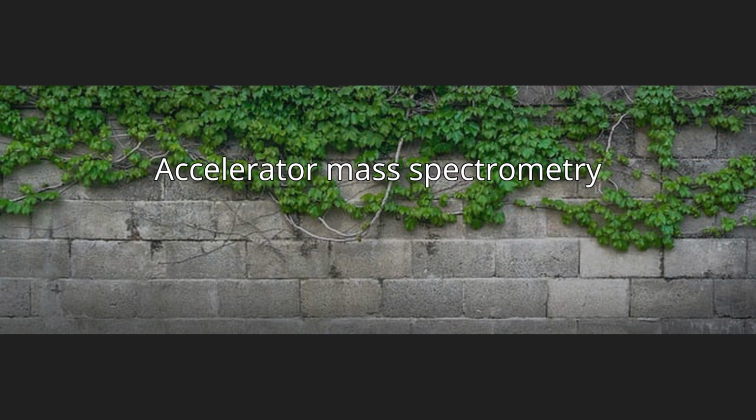This makes possible the detection of naturally occurring, long-lived radioisotopes such as 10Be, 36Cl, 26Al, and 14C. Their typical isotopic abundance ranges from 10^-12 to 10^-18. AMS can outperform the competing technique of decay counting for all isotopes where the half-life is long enough. Other advantages of AMS include its short measuring time as well as its ability to detect atoms in extremely small samples.